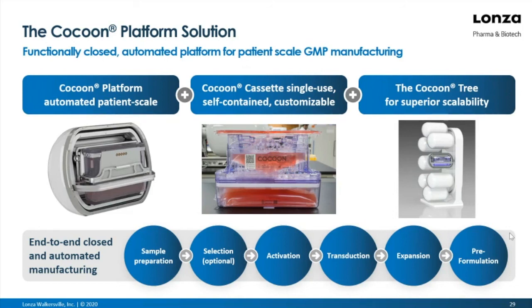Usually if they are working with CAR T, like blood cells, they are mainly suspension cells. But if you're thinking about adherent cells, this might not be so suitable because of the surface area. For mesenchymal stem cells, Lonza has experience in clinical trial manufacturing processes, and we usually use cell factories. We also try to move the mesenchymal stem cells into bioreactor systems, but currently we can only do it at a very small scale.